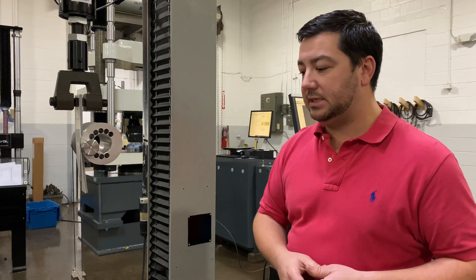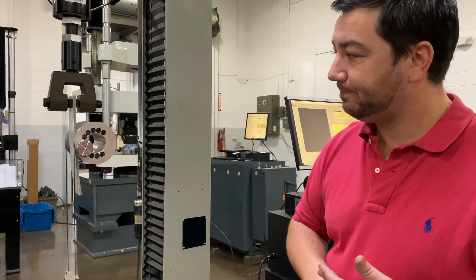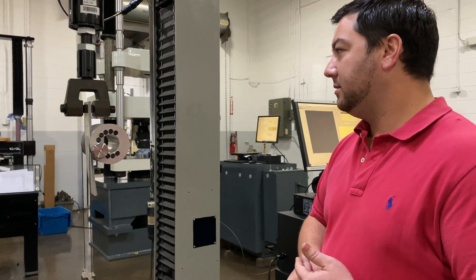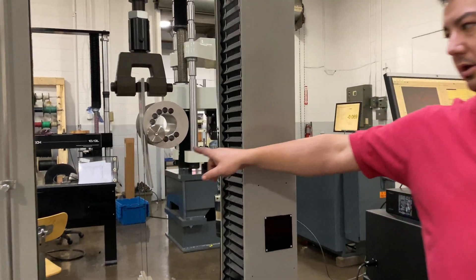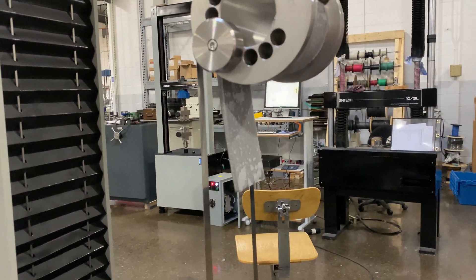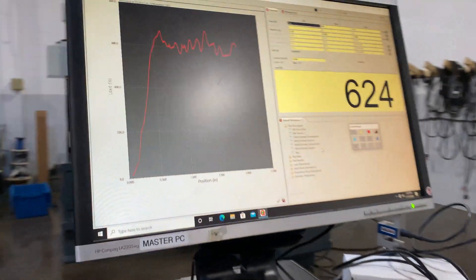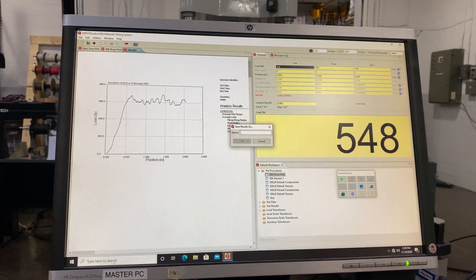So again, this is ASTM D1781, a climbing drum peel test. As we're finishing up, you can see this is peeling off the material. Quattro will stop specifically before it hits and give us our data.